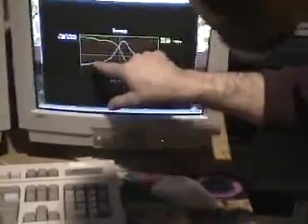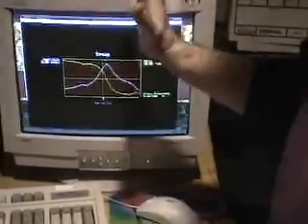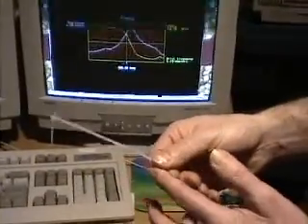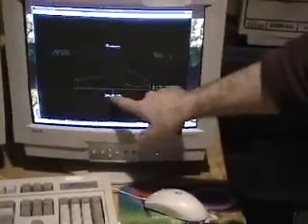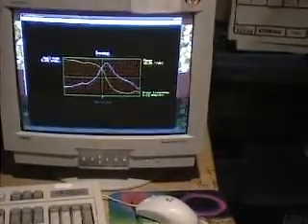If I look very closely, I can see the details are changing about once every second. When we're in actual tapping mode, it's going to be oscillating this little piezo that's at the base of the cantilever at a unique frequency, which is graphically indicated by the center line of this graph, and it tells you right now it's 366.95 kilohertz, which is typical for this type of cantilever.